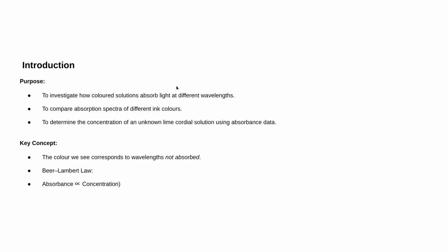Anyway, introduction. The purpose of my experiment was to investigate how colored solutions absorb light at different wavelengths. I was also tasked to compare absorption spectra of different ink colors, as well as determining the concentration of an unknown lime cordial solution using absorbance data.